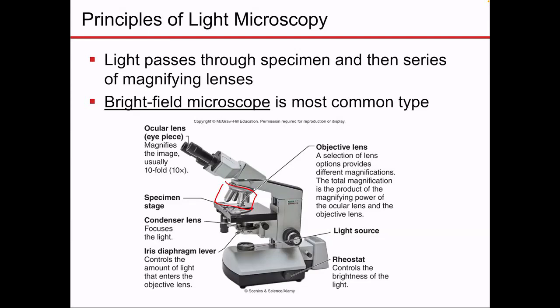And then a second lens, that would be the ocular lens or eyepiece lens. That one further magnifies that image created by the objective lens. So basically, the use of a compound objective ocular lens combination allows for a much higher magnification. These compound microscopes usually feature exchangeable objective lenses like you see here, allowing you to choose different objective lenses that give you a different magnifying power.